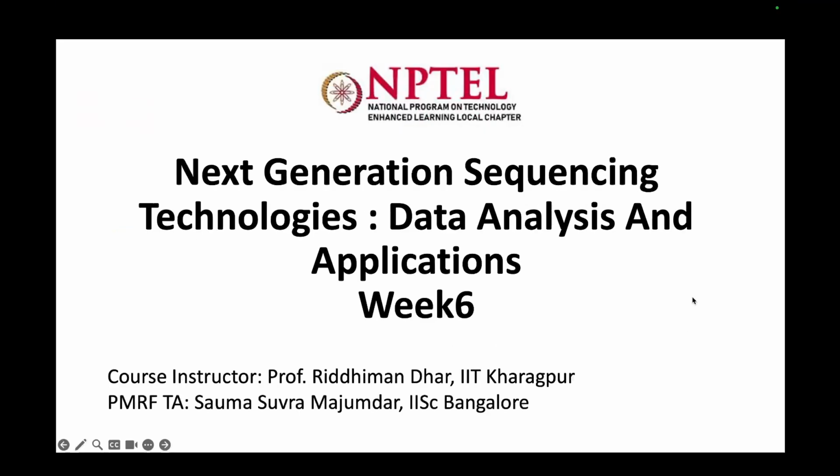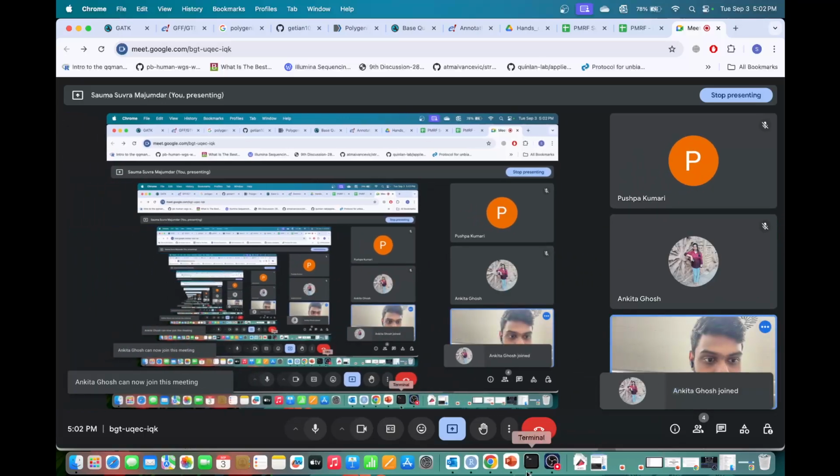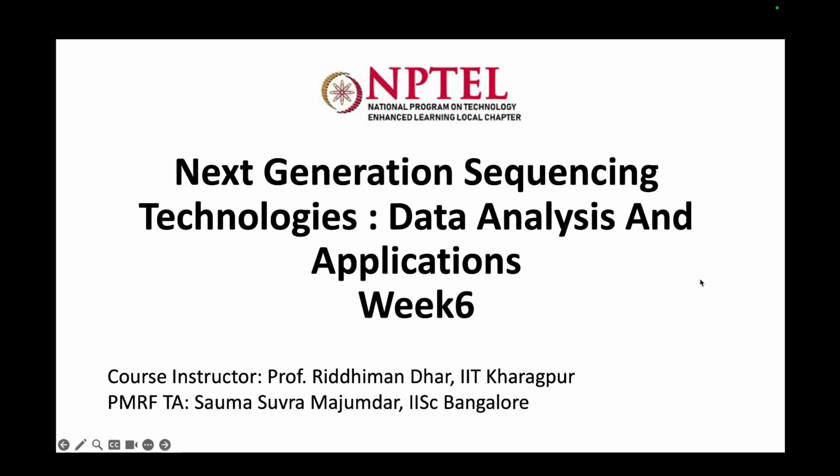So this week we'll mainly look into variants and how to store the variants in different formats, basically VCF, and how to run downstream analysis on those as well. So annotation and functional impact and stuff like that. And before that, we'll touch up a little bit about different types of methods that we use to pre-process reads after alignment.